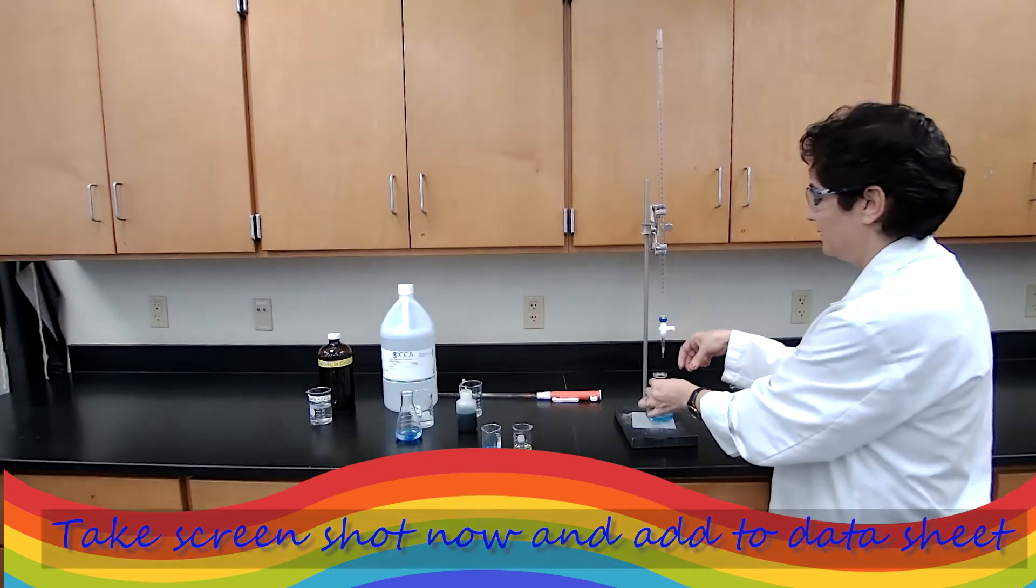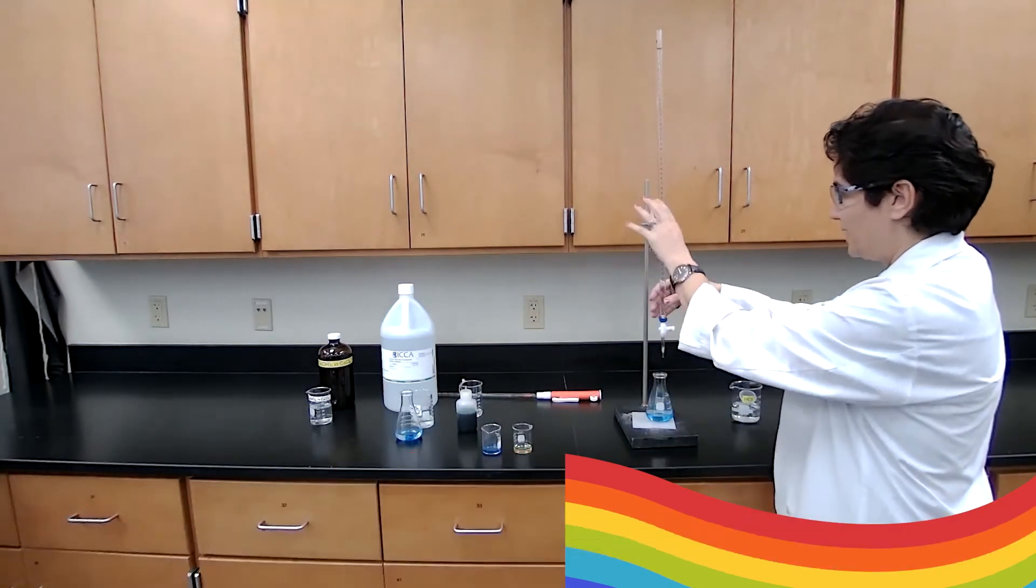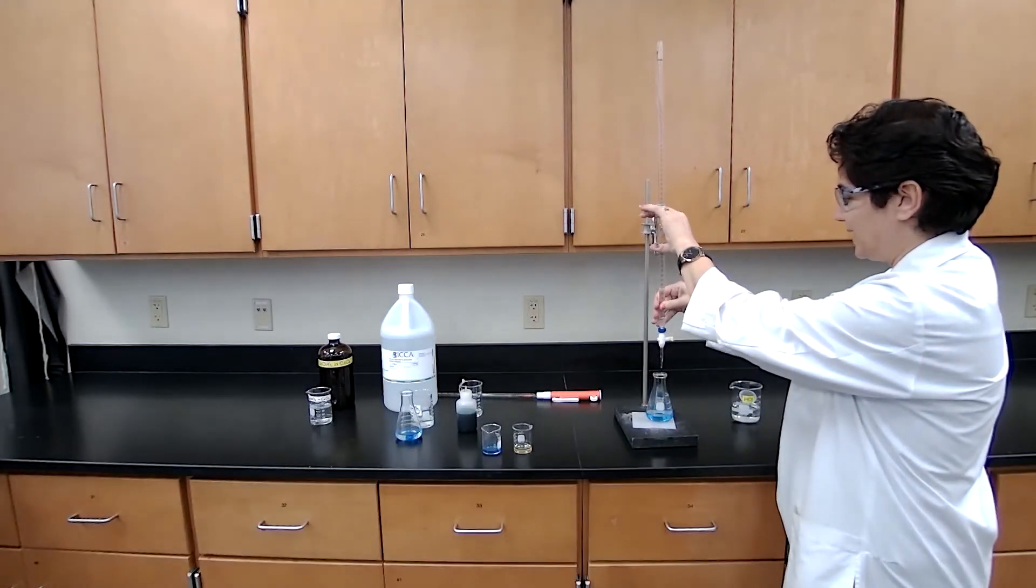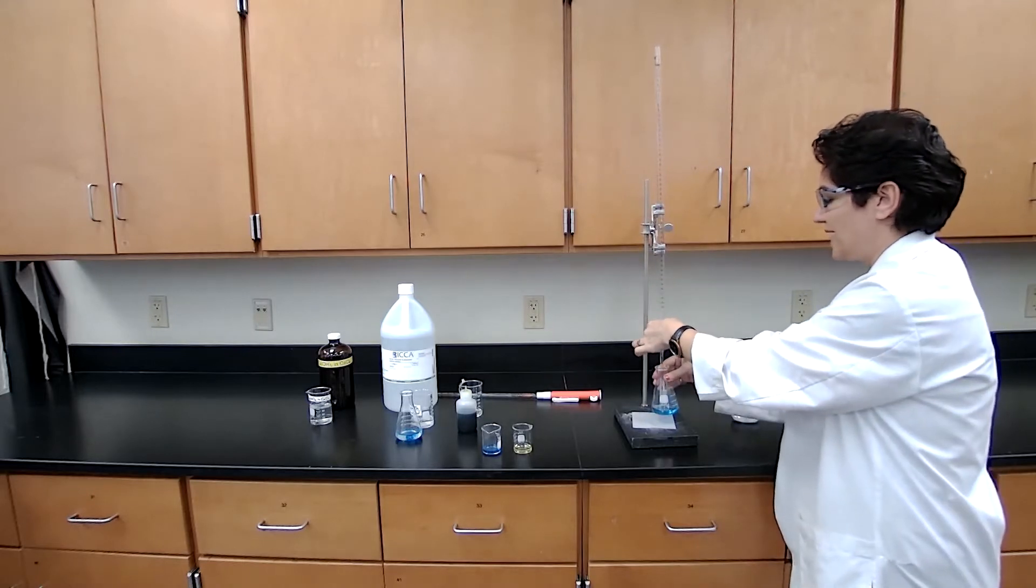I'm going to add drop by drop until I see a color change, which is the endpoint of the reaction.